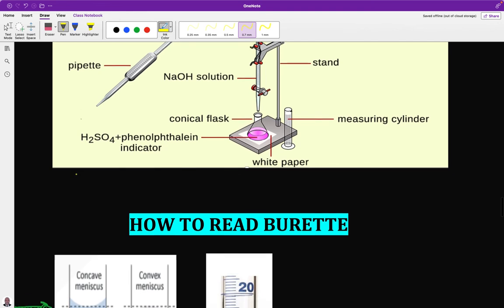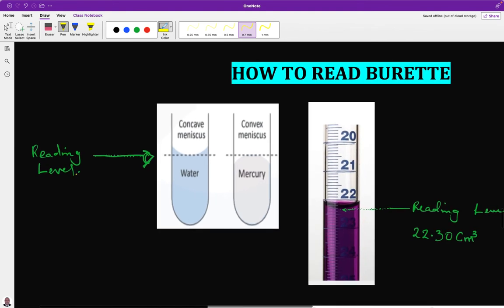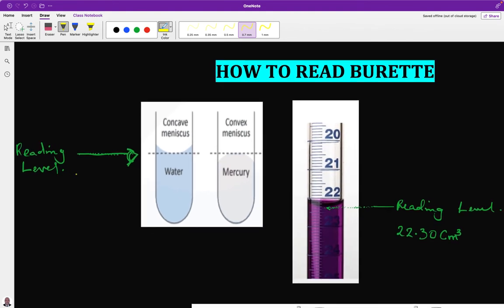How are readings done? How do you read your burette? There are two types of reading: how to read a thermometer and how to read a liquid solution in a burette. When reading a thermometer, the line you read should be at the mercury level — the meniscus should be below the line for you to take the reading.